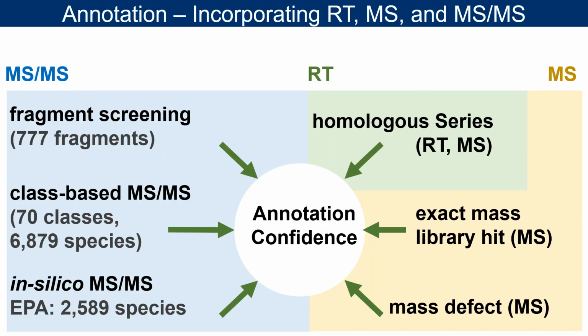And we've compared this across standards that were required, targeted methods that use retention time mass to charge libraries and triple quad approaches, as well as manual non-targeted approaches, and we find generally that we have a 100% match, which means these are highly confident annotations that the user can use right away.